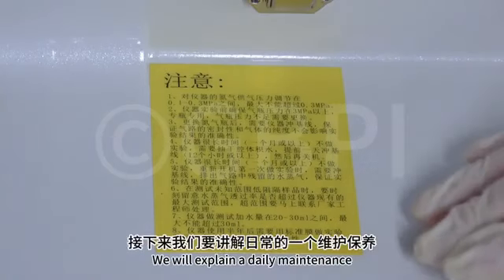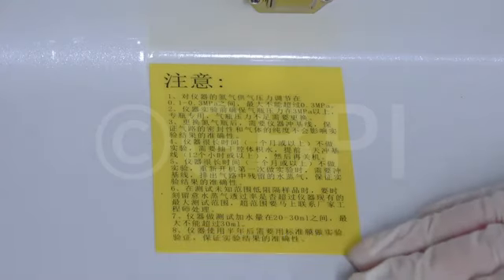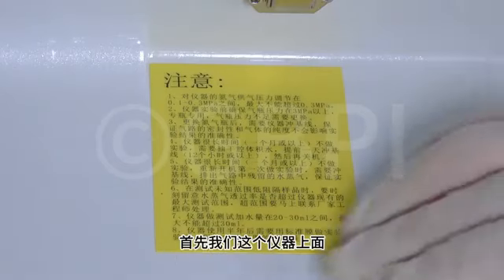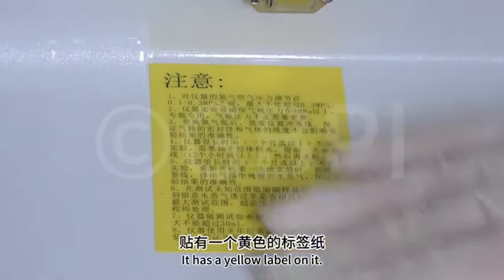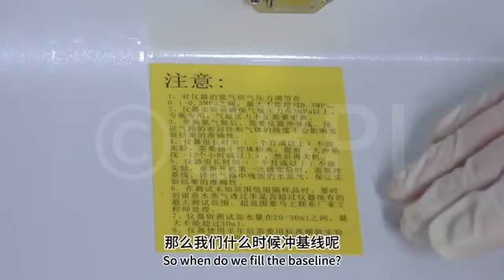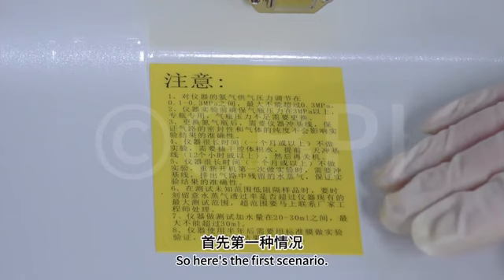Here we go. We will explain daily maintenance. First of all, this instrument has a yellow label on it. Here's a hint. So when do we fill the baseline? Here's the first scenario.